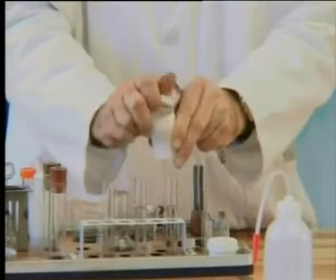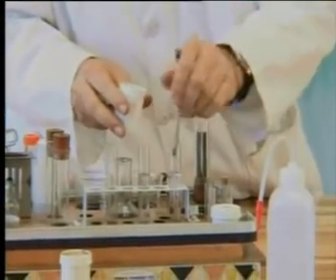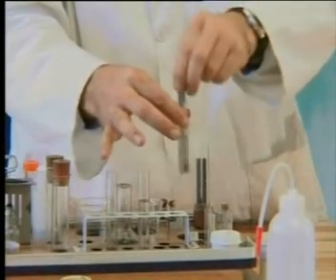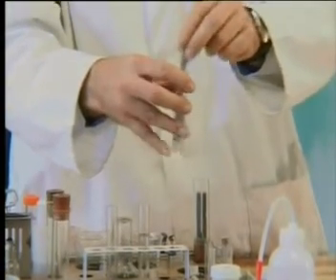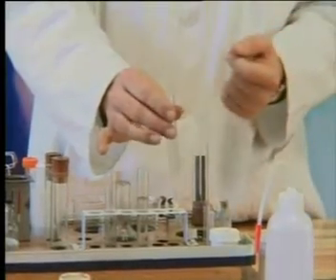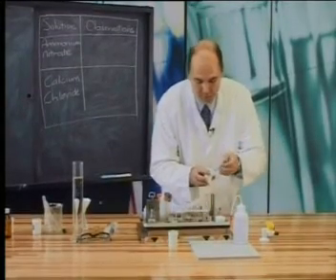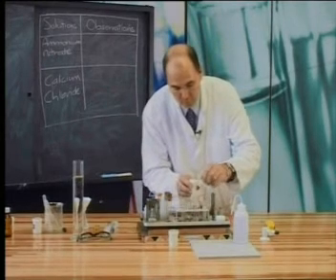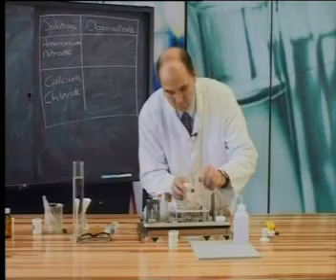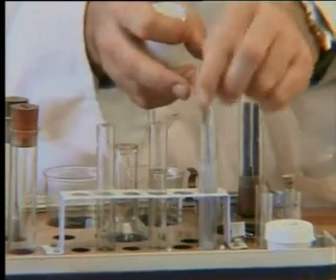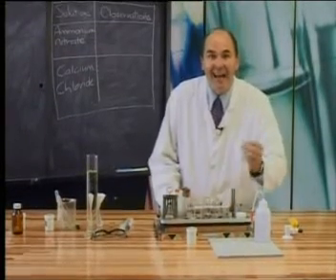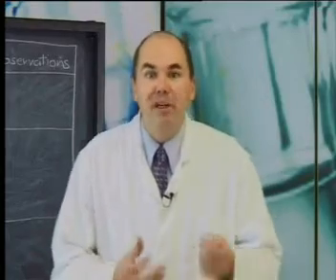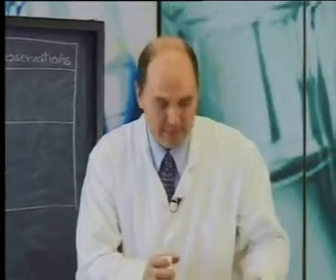First, I'll add some calcium chloride to this test tube and stir it. The solid seems to disappear. It dissolves in the water. This must be what happens when the calcium chloride and the water in the hot packs mix. It's getting hot. Now I'll add some more calcium chloride to this test tube. Now it's even hotter than before. The more calcium chloride I added to the solution, the hotter it became.